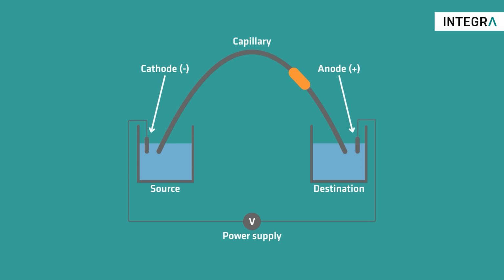After amplification, the DNA sample is run through a capillary gel electrophoresis system. Its capillary contains a gel that allows smaller STR sequences to travel faster through its pores. At the end of the capillary, a laser beam and a detector register the fluorescent tag of each sequence.